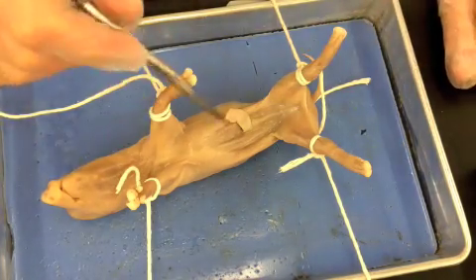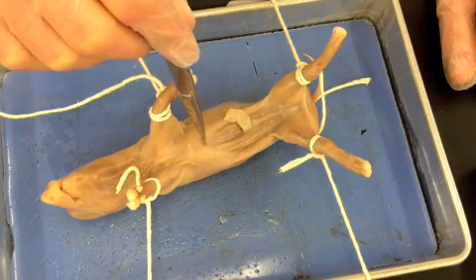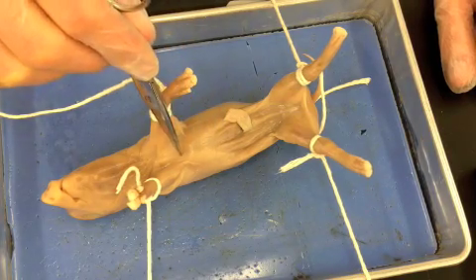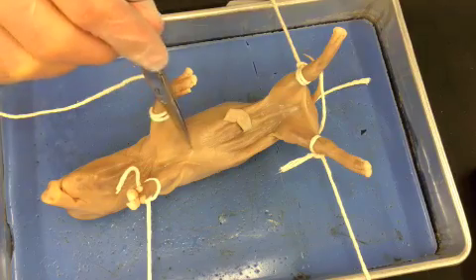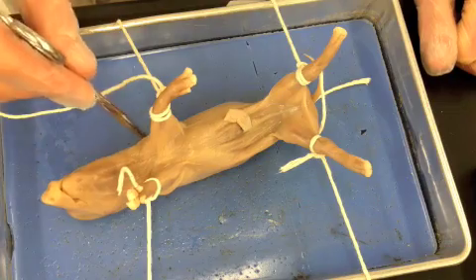The way that we're going to cut through the fetal pig is I normally start down here by the umbilical cord. I'm going to do a line straight up, getting through the muscle and the skin. Then you're going to hit the breastbone or the sternum, and you're going to cut through the sternum.